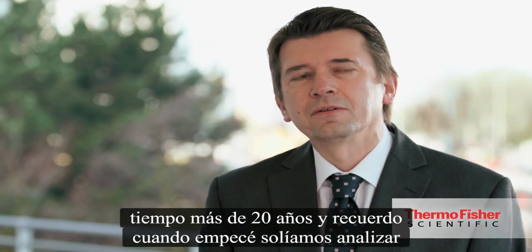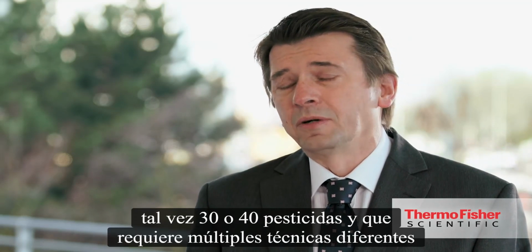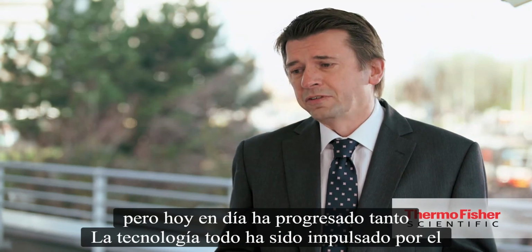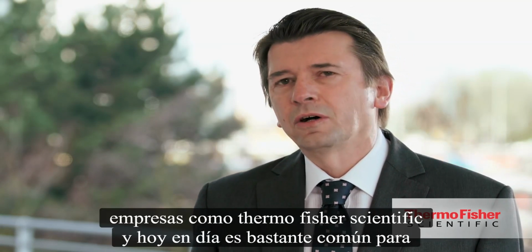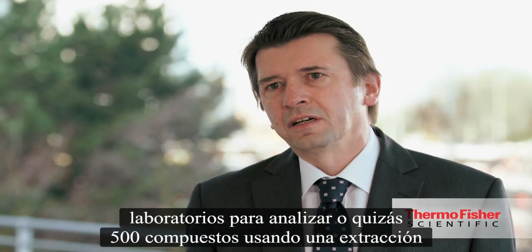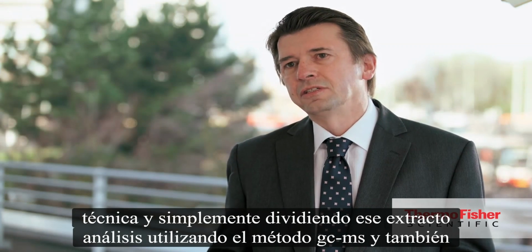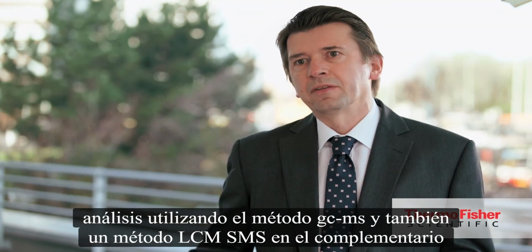I've worked in pesticides for a long time, more than 20 years, and I remember when I first started, we used to analyse perhaps 30 or 40 pesticides, and that required multiple different techniques. But nowadays it's progressed so much, the technology, it's all been driven by the technology which has been developed by companies like THERMO FISHER SCIENTIFIC, and nowadays it's quite common for laboratories to analyse 400 or perhaps 500 compounds using one extraction technique and just dividing that extract in analysis using a GC MS method and also an LC MS method in a complementary way.